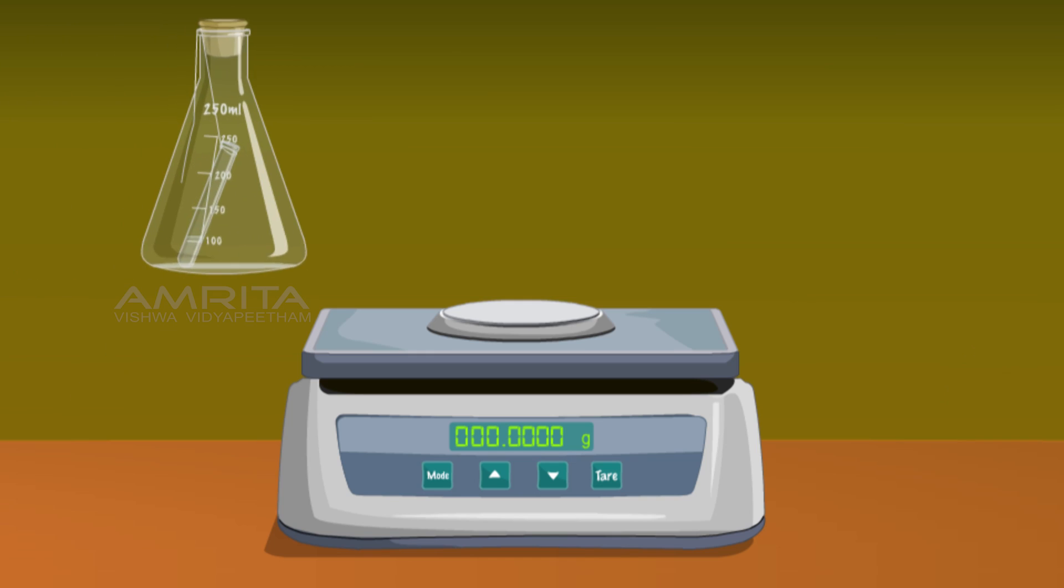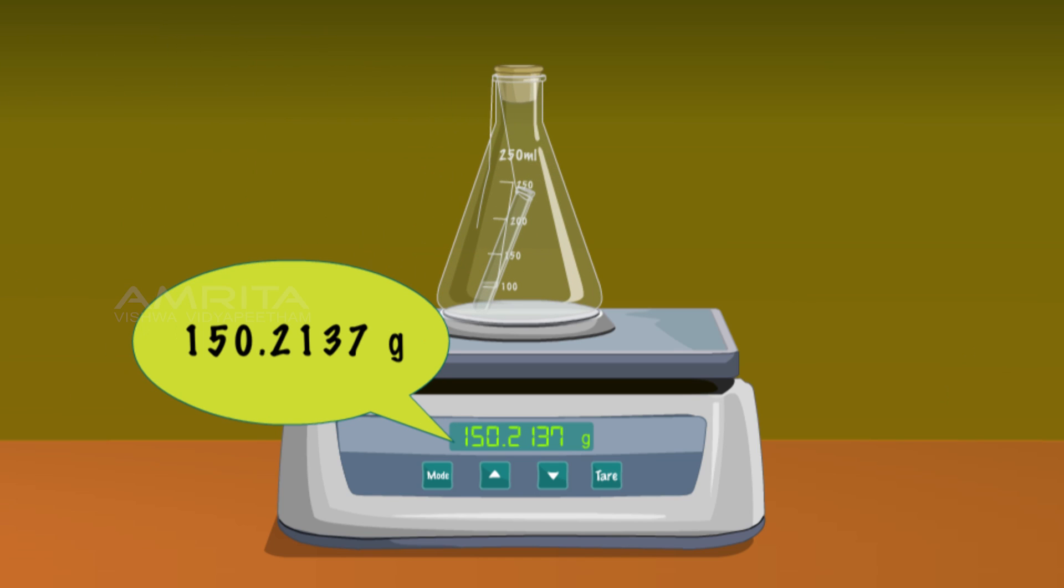Take the conical flask and carefully weigh the flask on an electronic balance with all the contents, ensuring that the solutions do not mix, and note the reading.